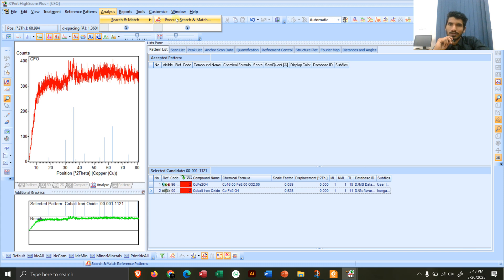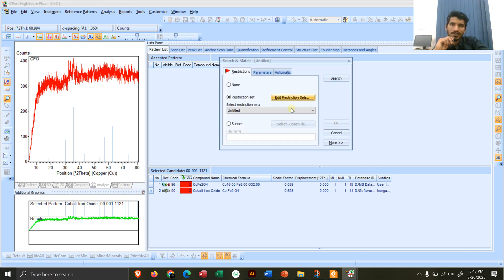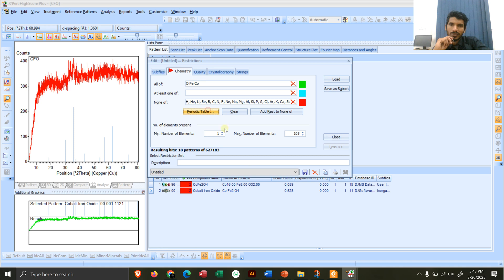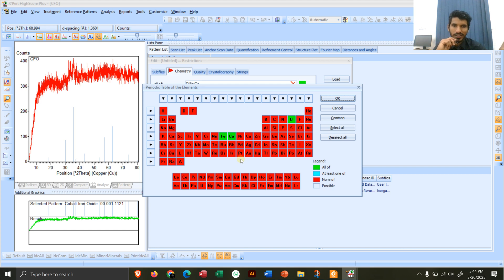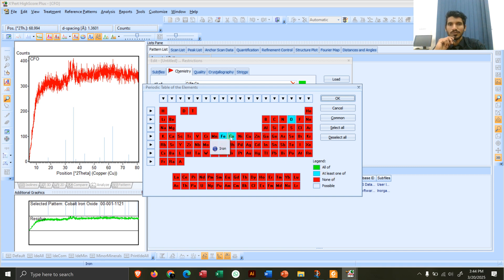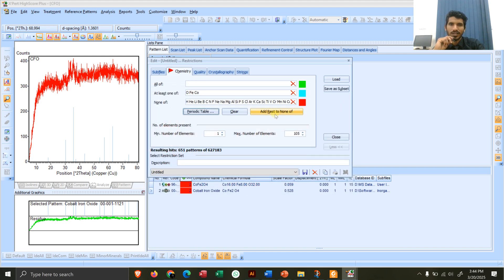To search for any other phases present, go back to Analysis → Execute Search and Match → Edit Restriction Sets → Periodic Table. Since cobalt ferrite (cobalt, iron, and oxygen together) is confirmed, set those green. Now for cobalt, iron, or oxygen appearing separately, set them blue — meaning at least one of them should be present. Click OK, then Add Rest to None, then Load, then Search.